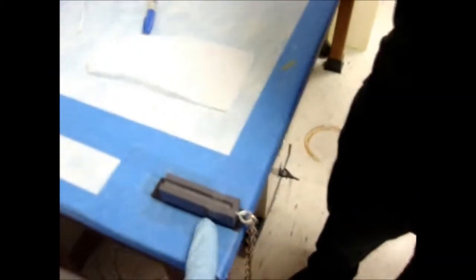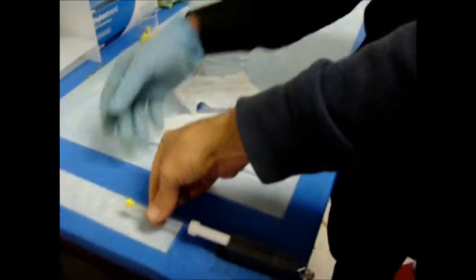Now you're going to want to put this on that, and then you're going to want to clean it again because you're going to size it on this to make sure that it is the proper distance. Why is it yellow? Actually, what you want to do is pull it down slightly. That's what I was saying. Yeah, to size it on this. Yeah, so go ahead and push it in like this.